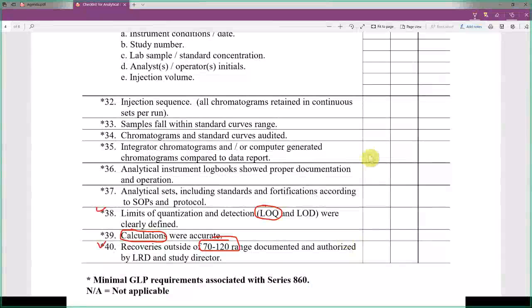If you run LC-MS, for example, and if you have all the parameters entered correctly, the instrument typically can print out all the things. Let's say print out. You can print out the area count.